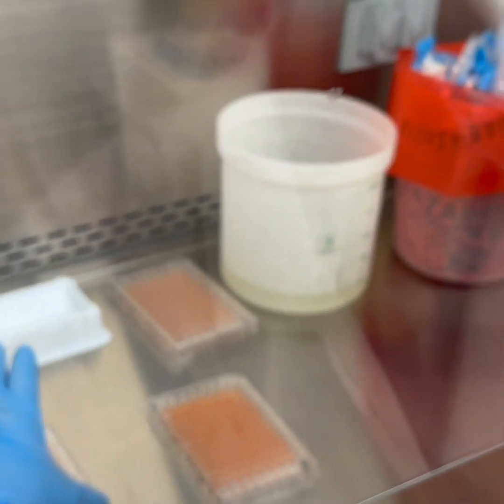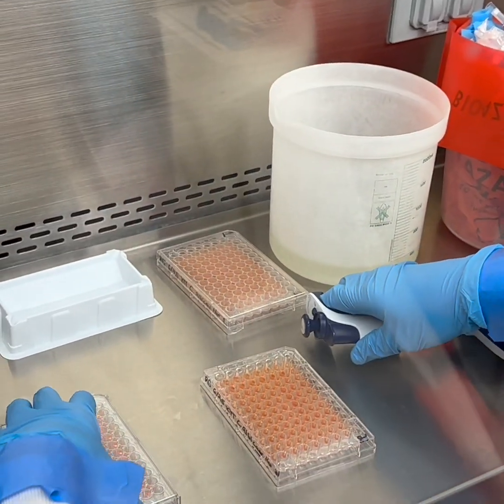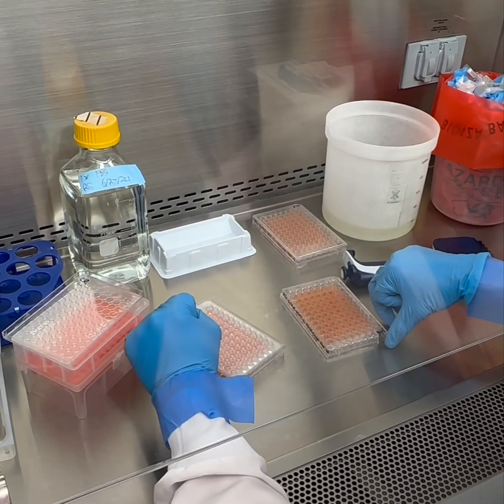Okay, you can get rid of your tips. And then you will make sure this is labeled, clean it off, and hand it out to your assistant for reading.